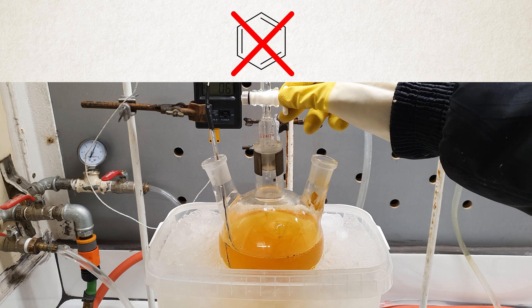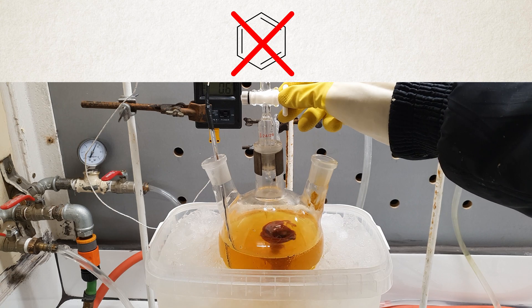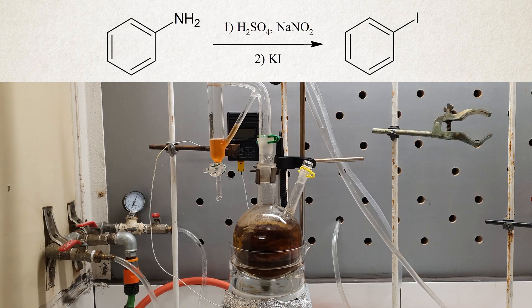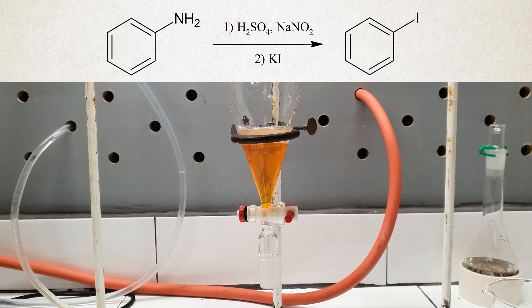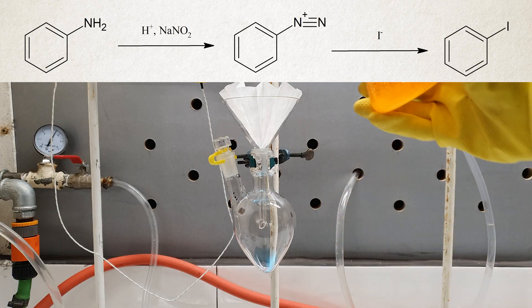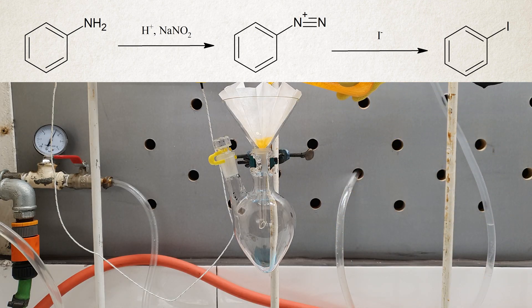This time I will not start directly from Benzene. While it can be done, an easier and definitely safer method is to use Aniline. I will firstly convert the amino group to a Diazonium salt, which I will then displace with Iodide. So let's get started.